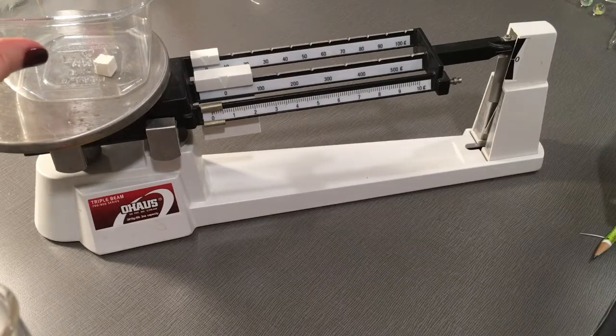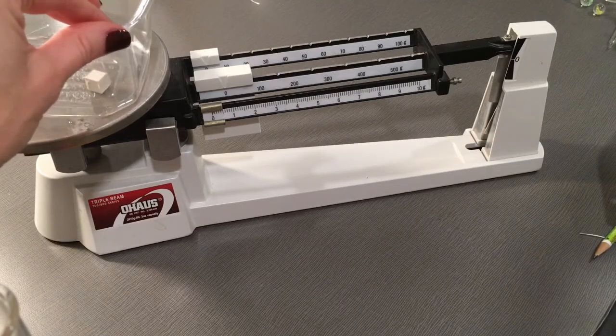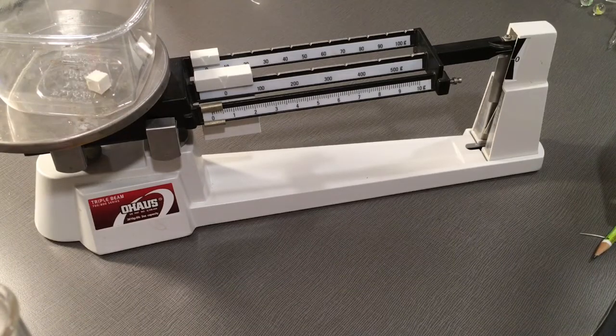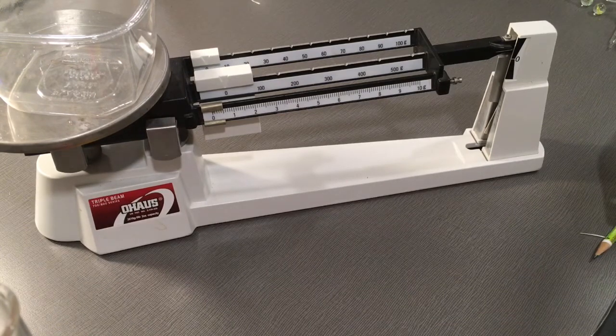You want to subtract the total mass minus the mass of the pan to get the mass of each of your objects. You're going to find the mass of the small cube, the glass marble, the sandstone rock, and the styrofoam ball.